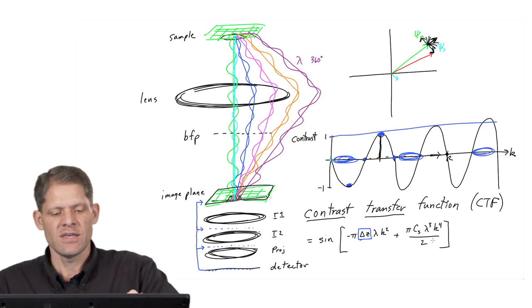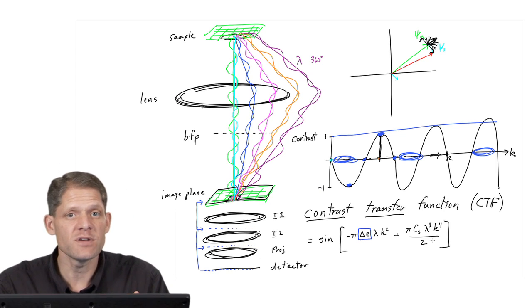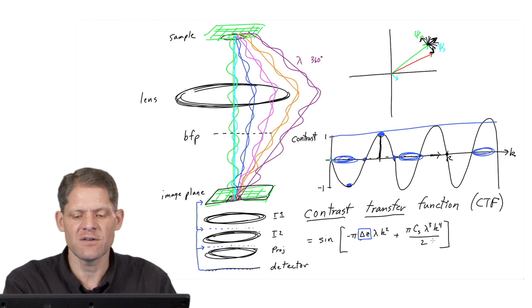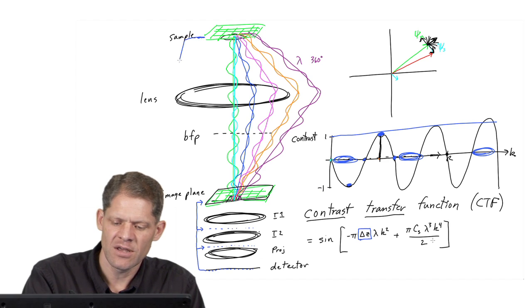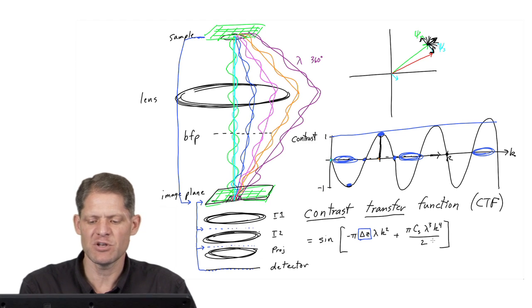Now, given the strength of the objective lens, namely the focus of the objective lens, if you change the focus knob, it changes the current through the objective lens, and therefore the strength of that lens. For any given setting of focus, the sample plane is going to be conjugate to some plane down here, which I've written as the image plane.